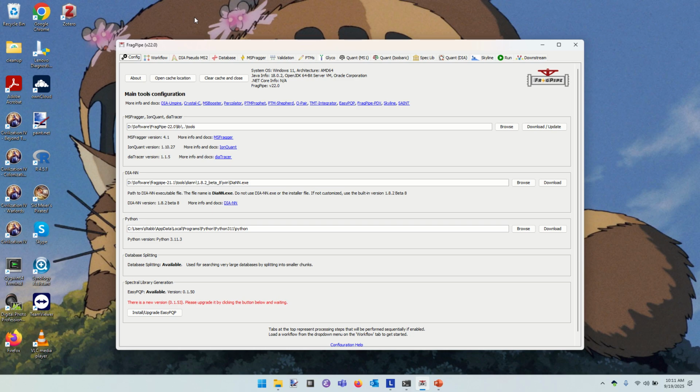So we can see then that we have all of these little tools that have been installed along with FragPipe to do all the work of identification and quantitation. If your software says that these are not yet present, you're going to have those installed. So you need to click through all the licenses and downloads to get those in place. Okay, we have some software called DIA-NN in the next block here. DIA-NN is external software made use of by FragPipe that is quite necessary in the DIA data analysis step that we'll do at the latter half of this morning.